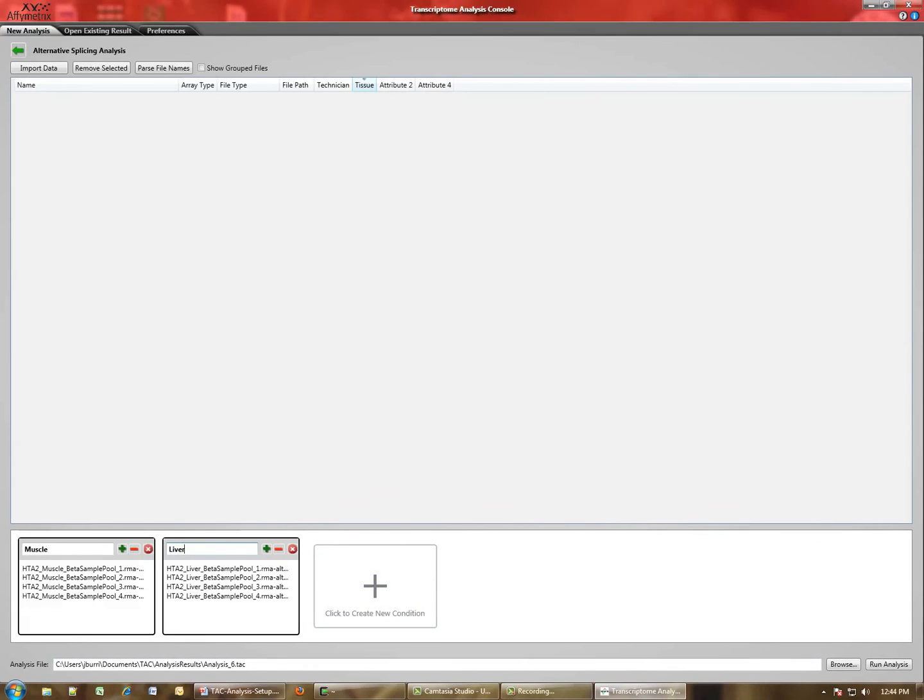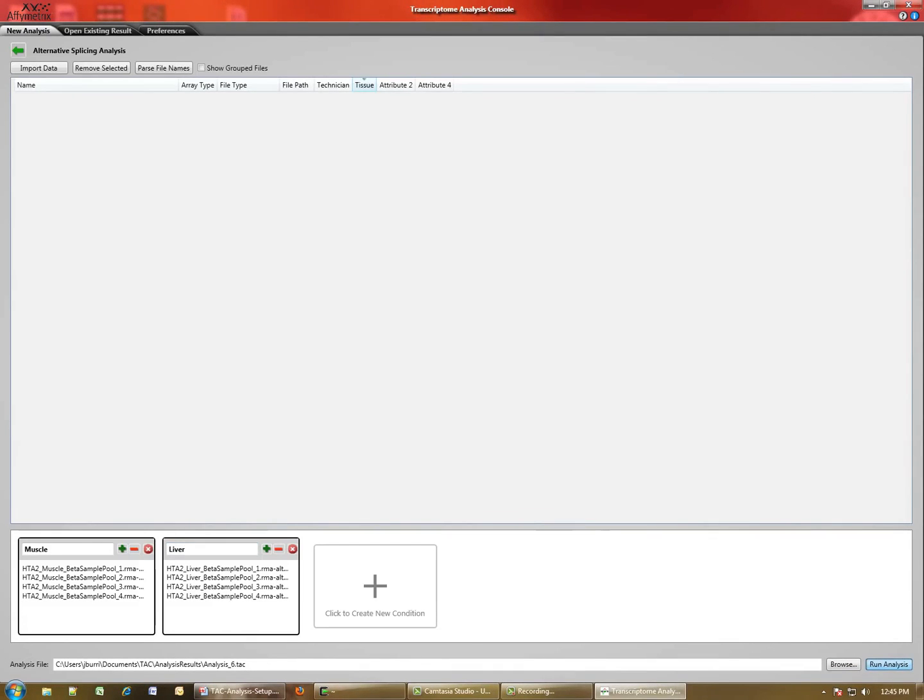Down here at the bottom is the analysis file location. This is where the results file will be stored. You can change that with the browse button. Now that we have loaded our chip files and defined our conditions, it's possible for us to run the analysis, which we simply do by clicking this button.